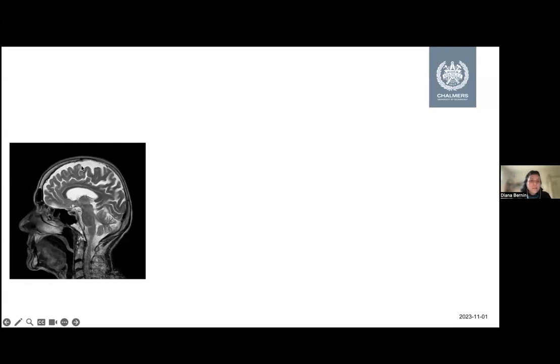And when you look at it, you can see that there are bright regions, but there are also dark regions. And the bright regions, that's the regions where you have a lot of fluid. And that's already an important part about the MRI. We measure only things that are mobile or that are liquid. So in this case here, you will image the water and you don't see the bones because the bones are solid. So MRI, there are more developments ongoing, but it basically measures what is liquid.